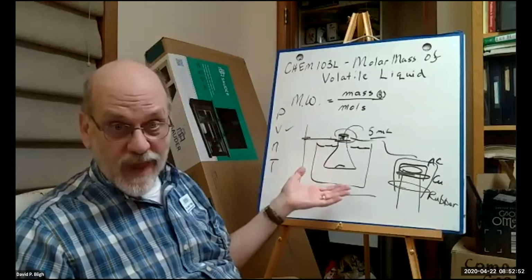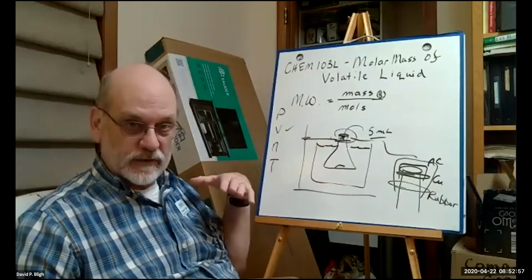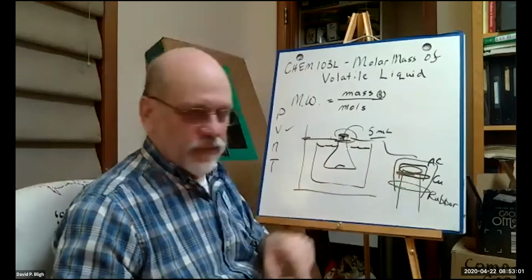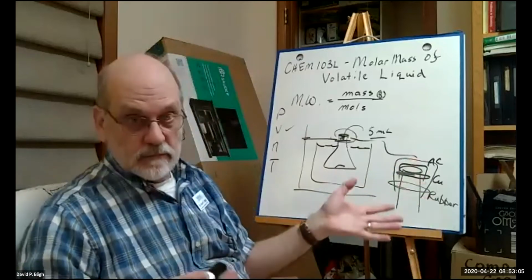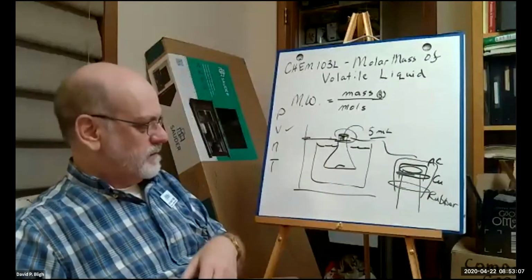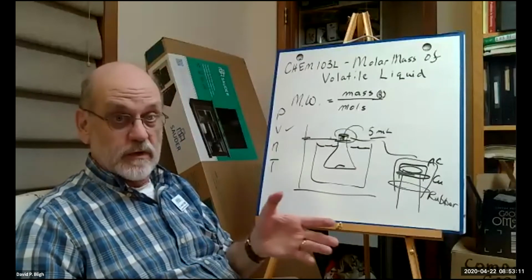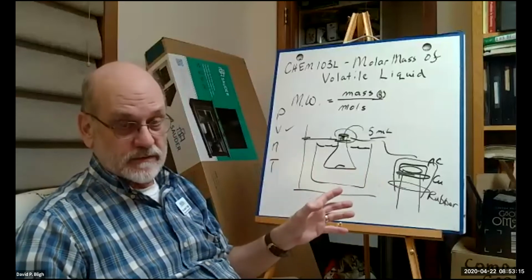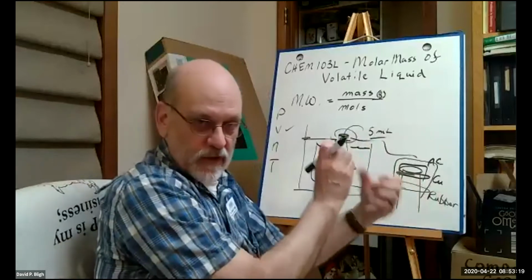But we're going to get it wet, right? So it needs to be dry when you weigh it, both before and after. So if you only had one piece of foil in there and a little bit of water got up underneath the foil, you're, as they say in impolite company, you're screwed, right? Because you've added weight that's not your gas. So what we do is we put an extra big piece of foil around there and cinch it down.